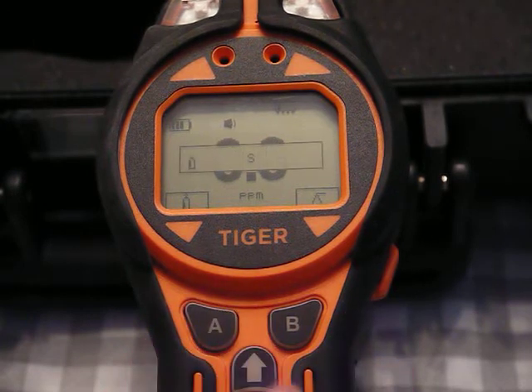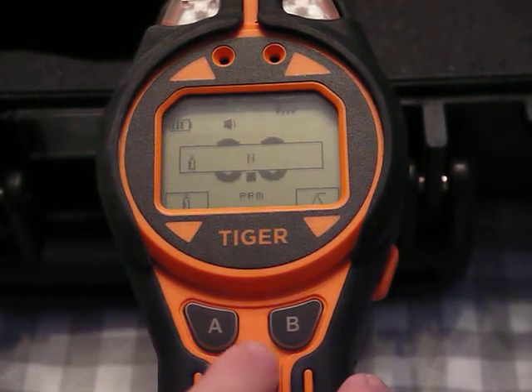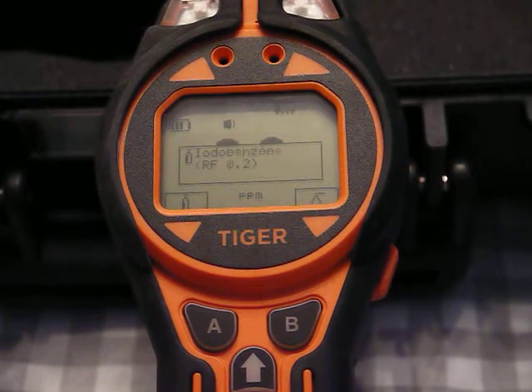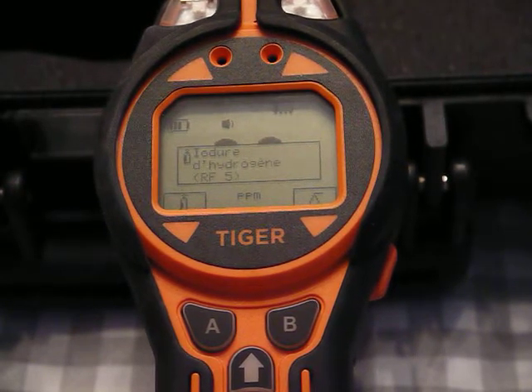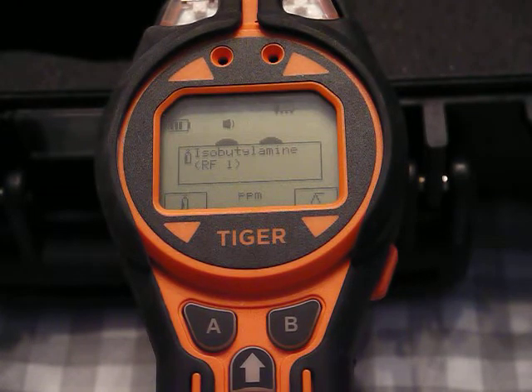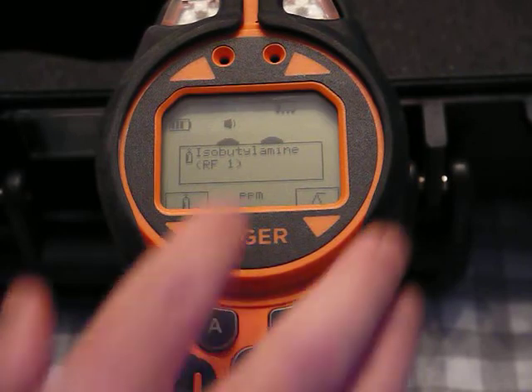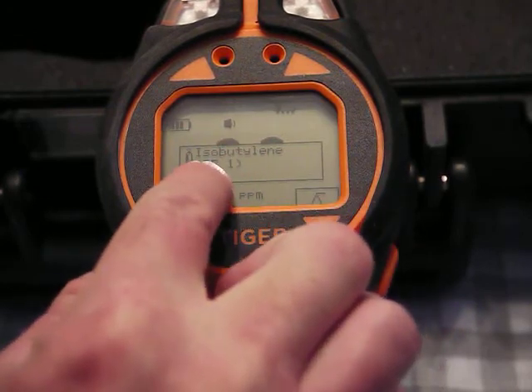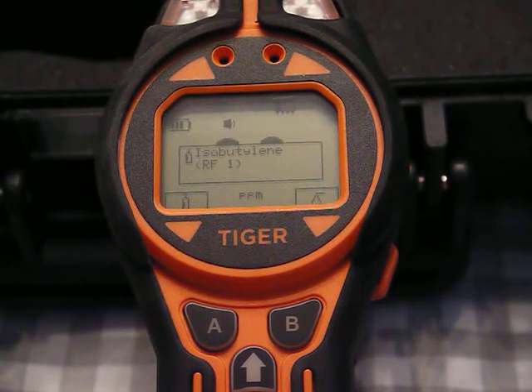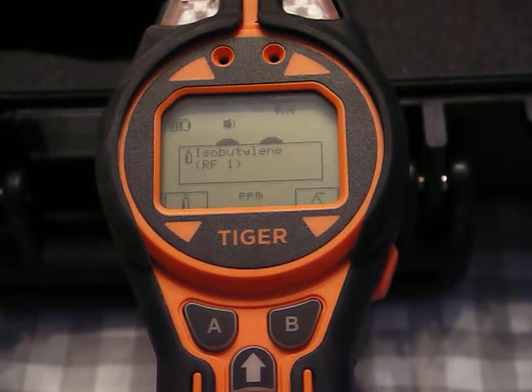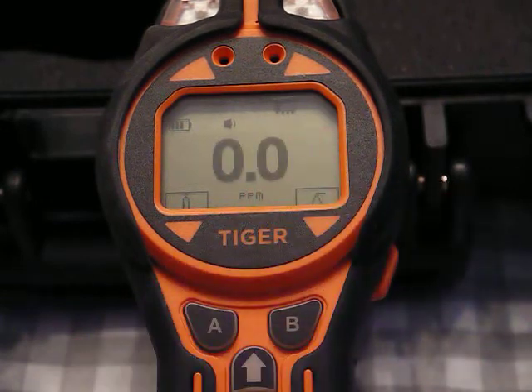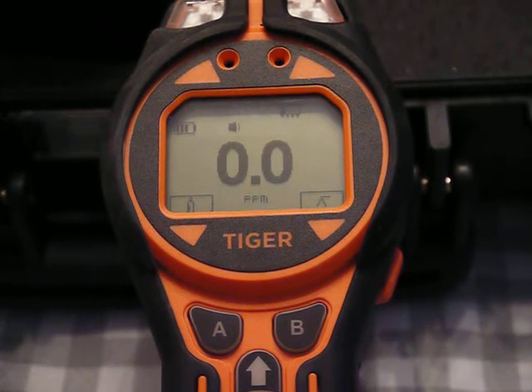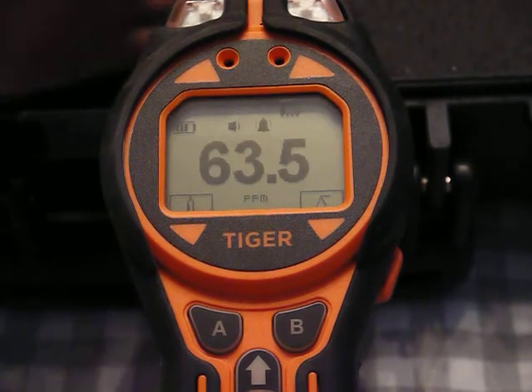Let me exit out of here. If I go back to the cylinder of gas and under button A, I'll go back through and look for isobutylene. Isobutylene has a response factor of 1 as well. I hit enter — which is the arrow button, the little on/off button — and the little check mark goes in. Now I'm reading in total VOCs calibrated with isobutylene.